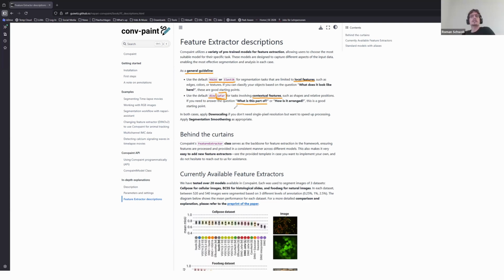What it basically means is it's a rescaler that helps you increase the resolution, because Dino V2 being a vision transformer works with patches, and then it can give you a patchy segmentation. So the resolution of default Dino without the Jafar part is basically 14 by 14 because of this patch size, and the Jafar helps you really increase and amplify your resolution.